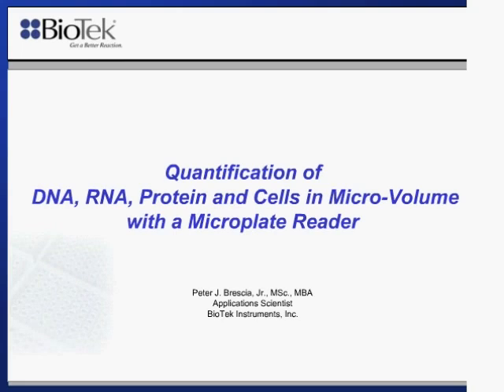As you can see from the title slide, today I'll be discussing microvolume analysis using a microplate reader, and I'll discuss quantification of DNA, RNA, protein, as well as some cell work. With that, I'd like to start off by presenting a poll question to get a feel for what you all are working with today. So I will go ahead and present that to you now.